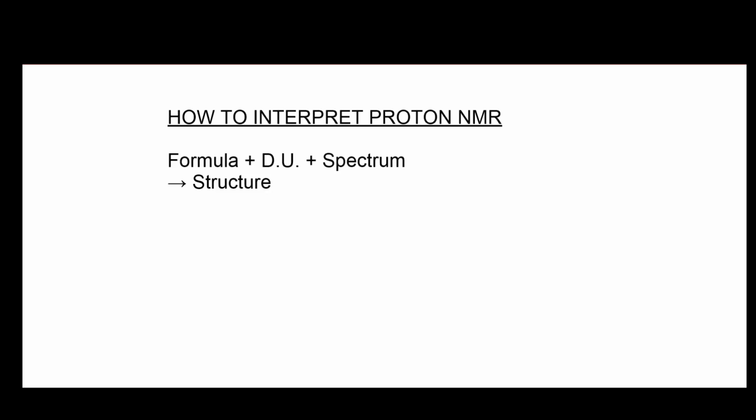Now that we have learned chemical shift, integration, splitting, and degree of unsaturation, let's put everything together. In this video, we will interpret proton NMR spectra step by step and deduce the structure.